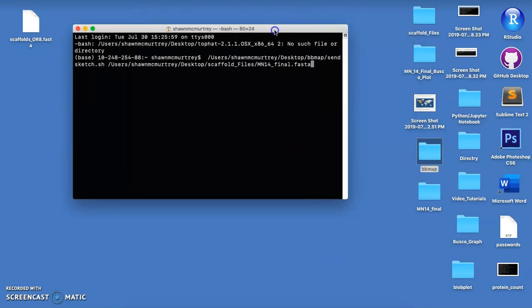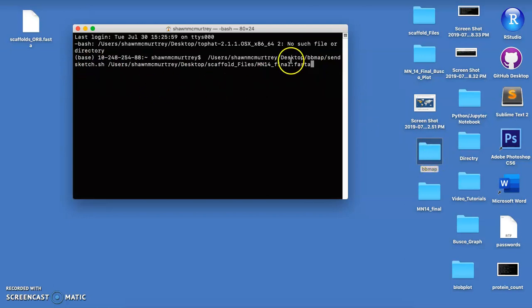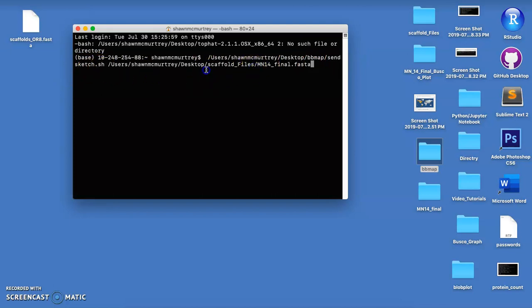The command for this one is just the path to the BB map, to the BB tools folder, and then this is the command send sketch dot sh. And then the only other thing you need is the path to your file.